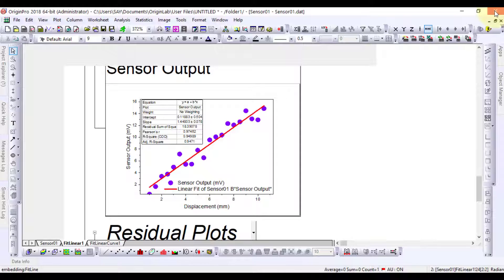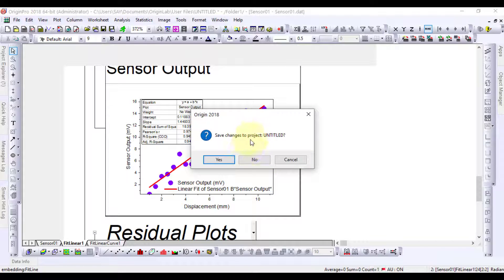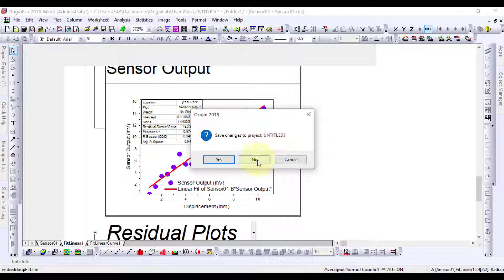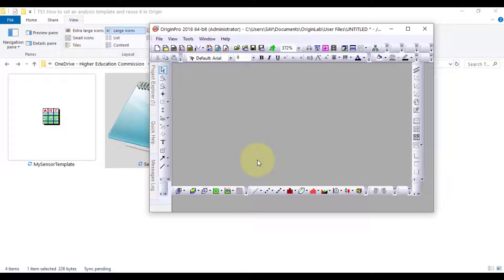Let's close the project. It asked to save changes. As we have already saved the template, close the project without saving.